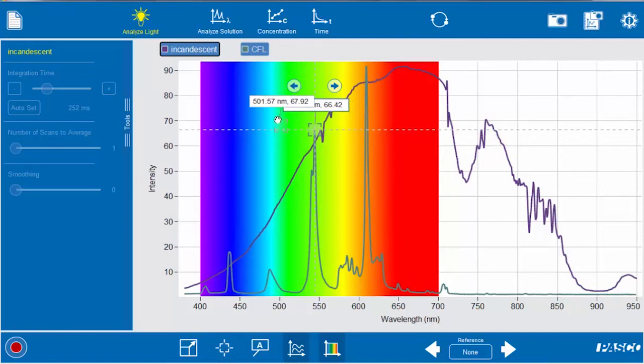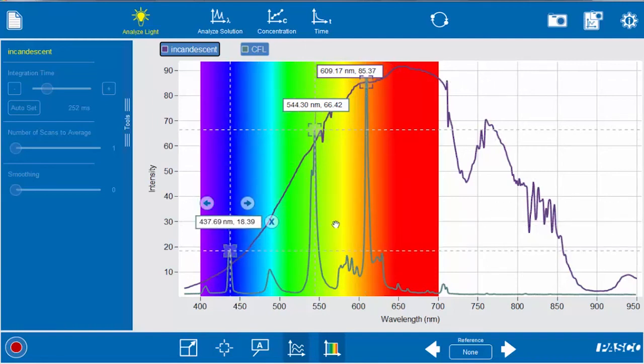Also you can add another one if we wanted to look at that peak. So you can add as many of these as you would like and you can also delete them if you want to remove them.